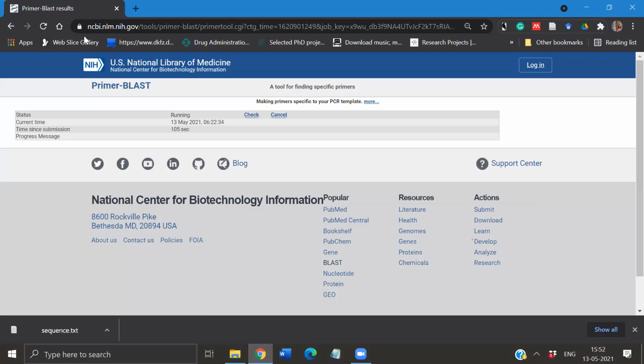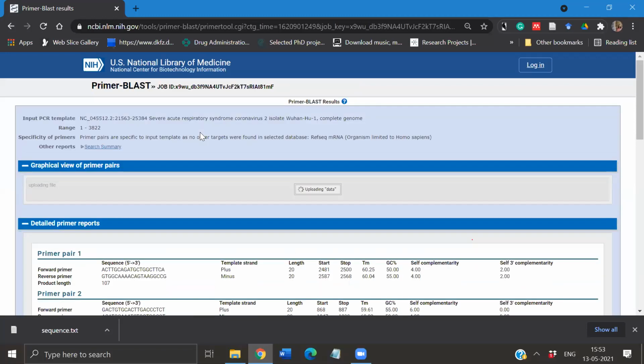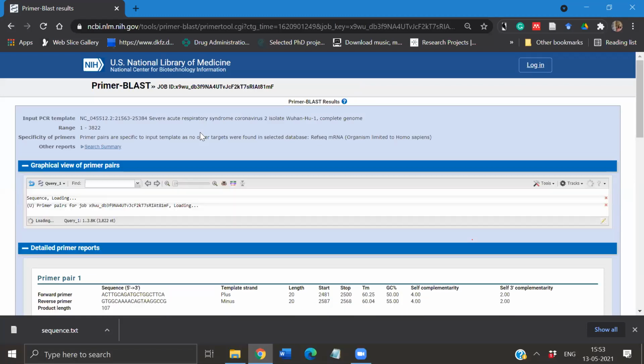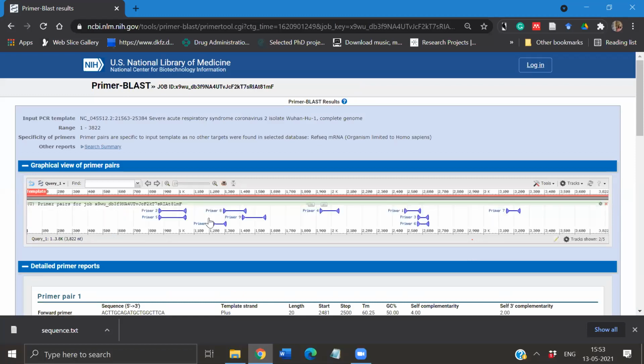Since all the sequence details have been given to the participants, we will also upload this video to everybody. They can do that. But I think some of these software tools can be used like what you are showing, to design the primers looking at many considerations, including the Tm value, GC value, and length. Many things can be taken into account. Now you can explain further that a lot of possibilities are here to choose from.